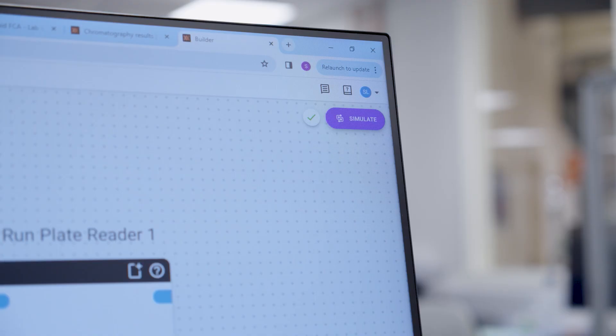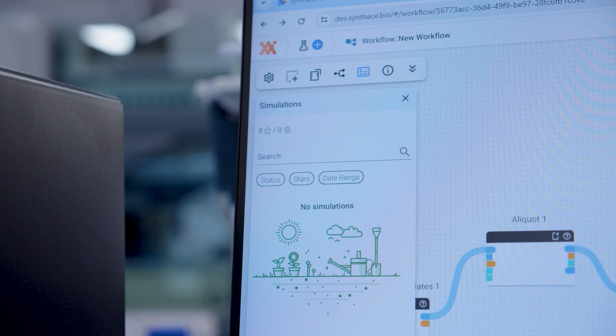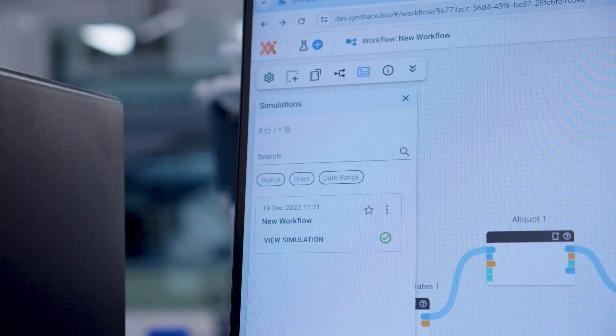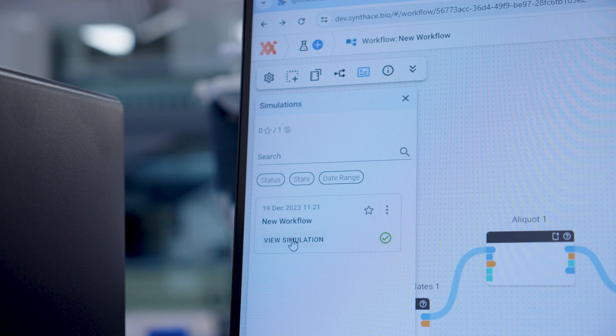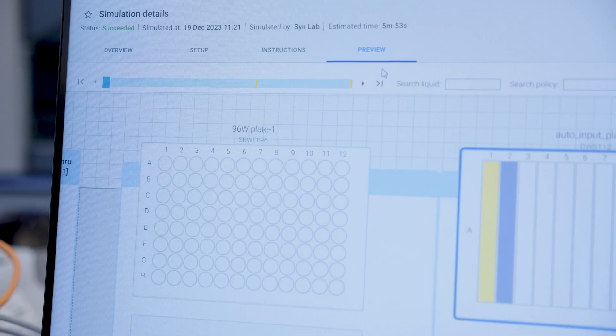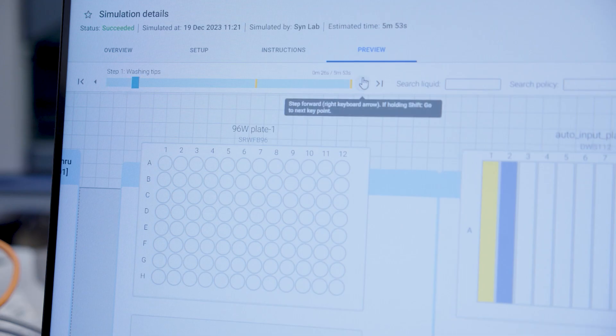When your workflow is complete, click simulate. Synthase will digest the information from your workflow and generate instructions for your Fluent shown in the preview tab.